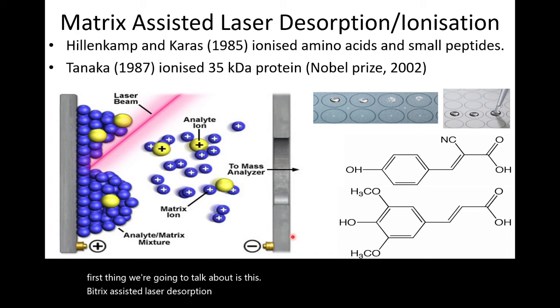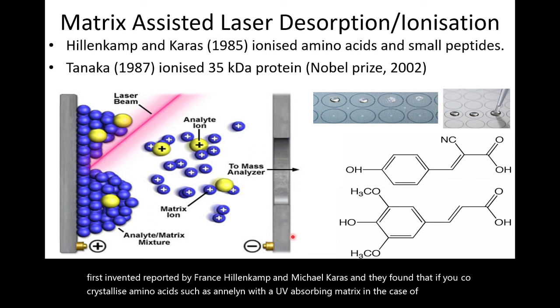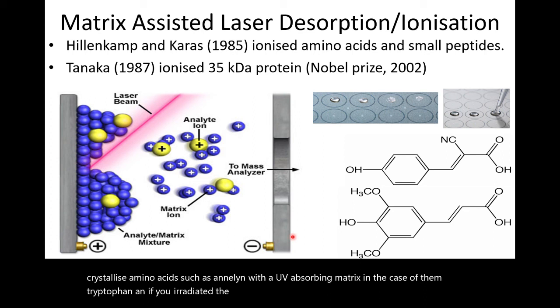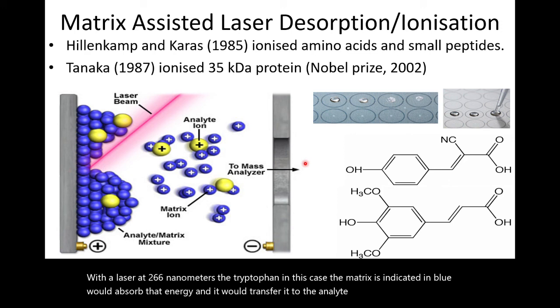And this has been around since the mid-80s. It was reported by Franz Hillenkamp and Michael Karas. They found that if you co-crystallize amino acids, such as alanine, with a UV-absorbing matrix, in their case tryptophan, and if you irradiated the sample with a laser at 266 nanometers, the tryptophan, the matrix indicated in blue, would absorb that energy and transfer it to the analyte and cause it to be desorbed off this plate as charged molecules into the analyzer.